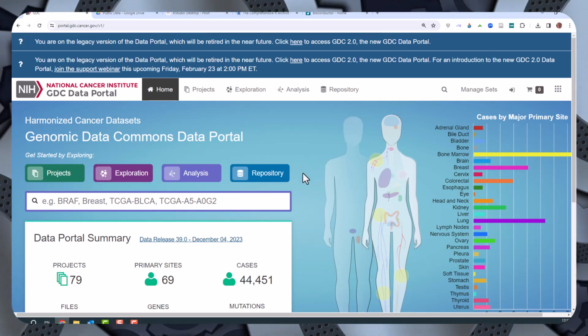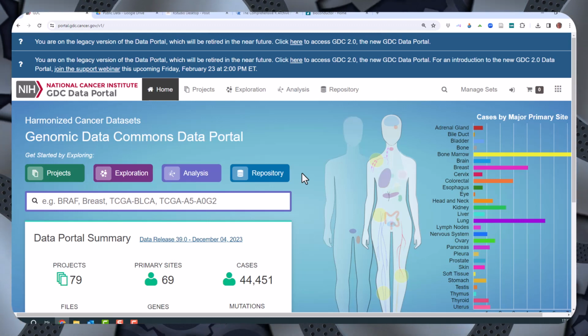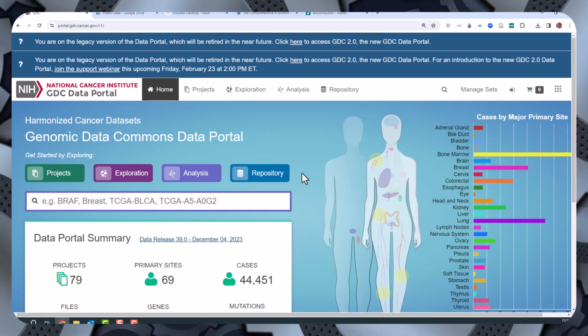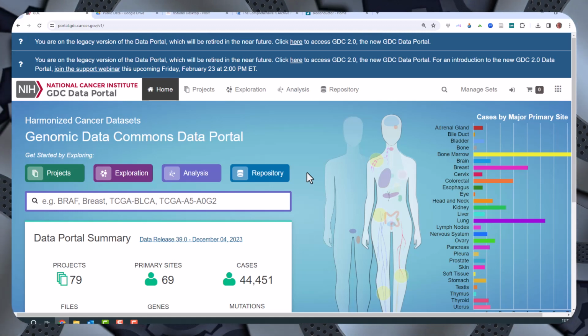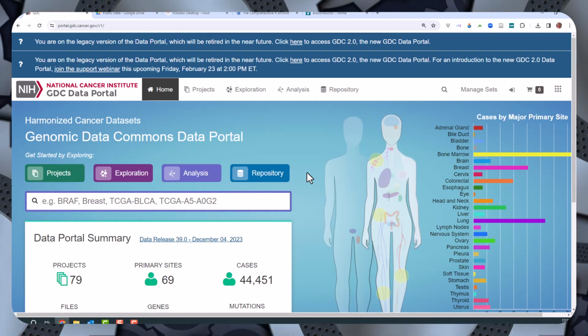Now, when you're doing bioinformatics, you're dealing with thousands of files and lots of data, so you don't want to do it by hand. You want to use automatic tools, and particularly you want to program a system which will take your data and take it through most of the different steps on its own, so you only have to make small alterations to a piece of code to allow you to do the analysis. So this is a workflow. The workflow that we're going to use, I've already pre-written as a script which just needs to be customized for your particular hypothesis and your particular question.